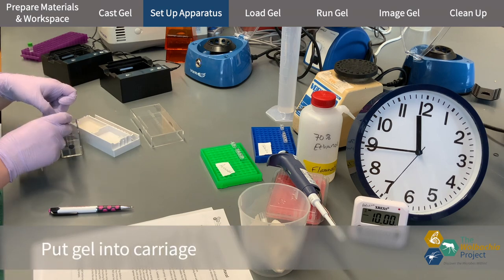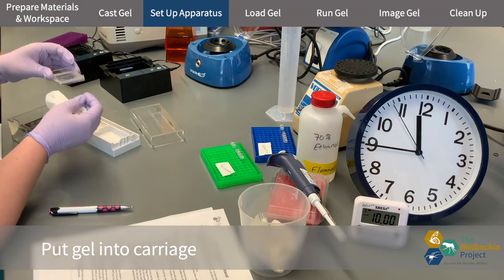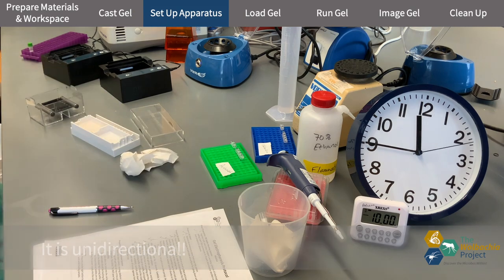With the Mini One system, there's only one way the gel goes in and the combs should always be towards the top negative end of the carriage.